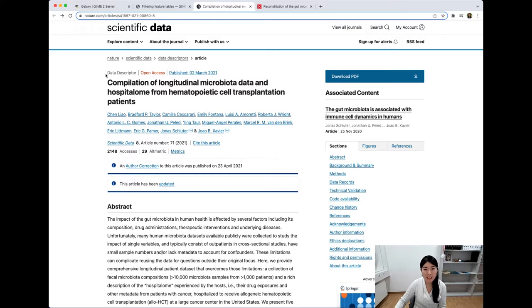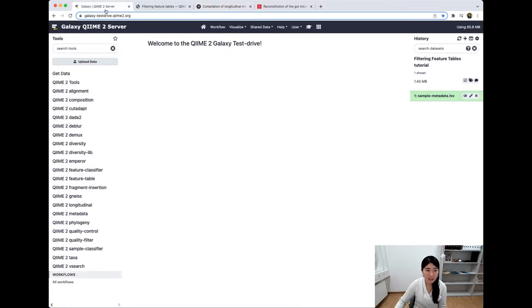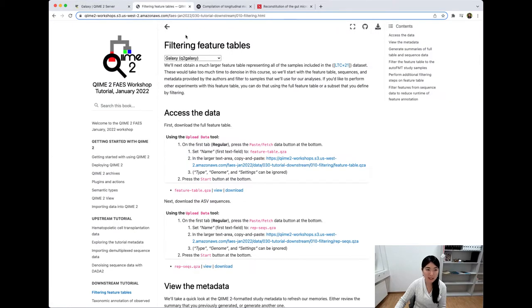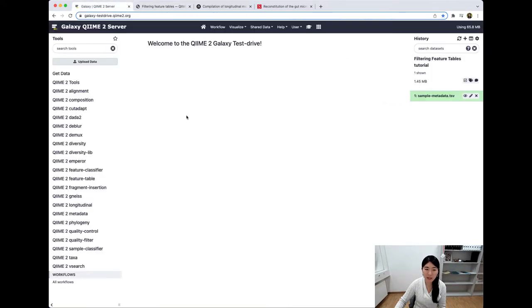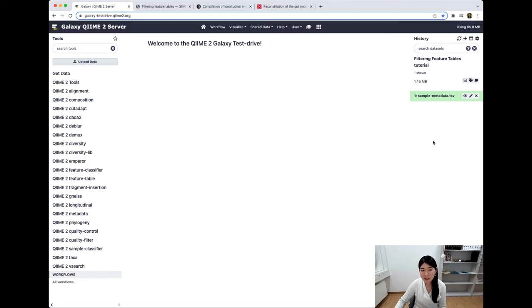Let's get started by heading to our Galaxy server. Throughout this tutorial, I'll flip back and forth between this tab and this one — the tutorial page to follow the instructions, and the Galaxy server page where we'll implement these commands together. As a heads up, my history looks slightly different from yours. You've been going through a few tutorials, so you'll have much more in this right-hand history.